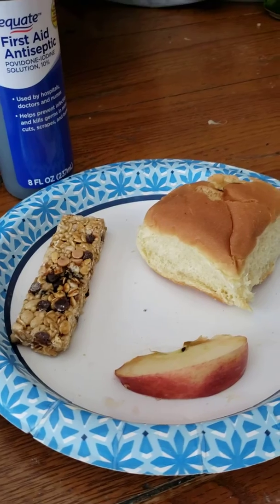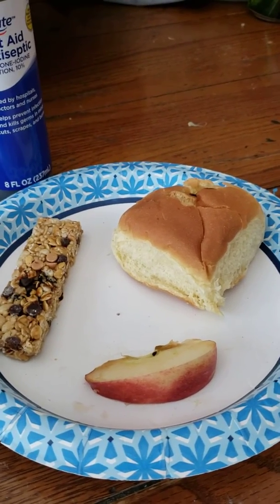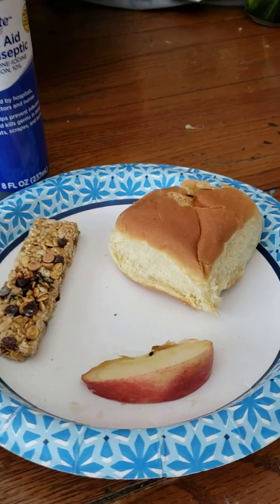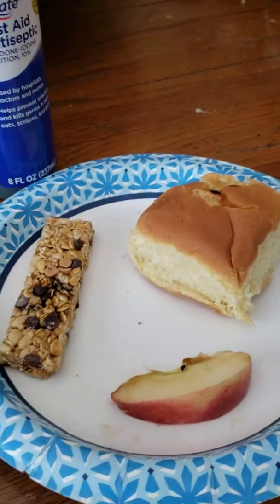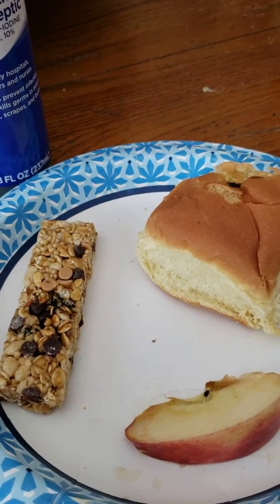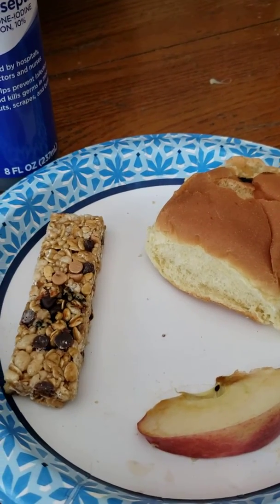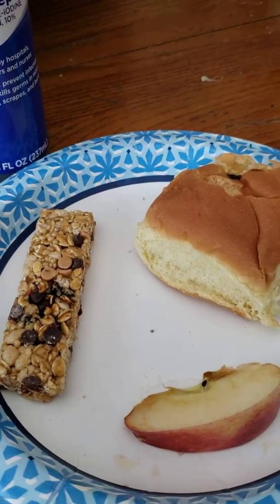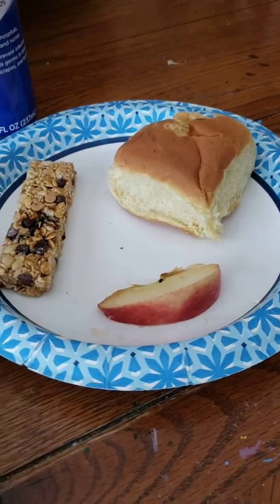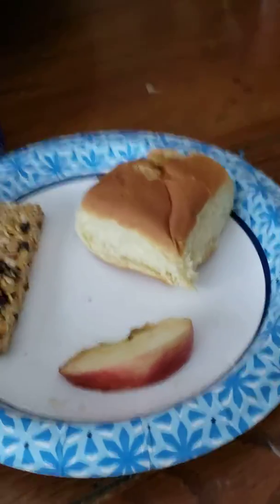digesting enzyme produced by your salivary glands. It converts starch and glycogen into simple sugars, and it also begins the chemical process of digestion. And if it turns a reddish, purple, or a brown color, that means it reacted with amylopectin, which is a digestible branch chain type of starch composed of glucose units. And if it stays the same color, there's no color change, that means there's no starch content.